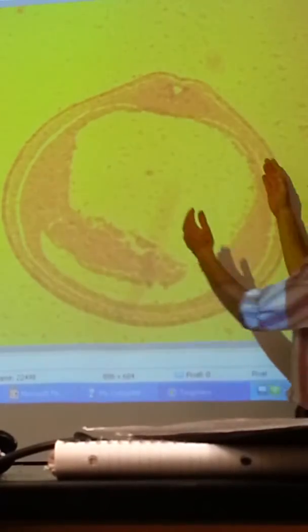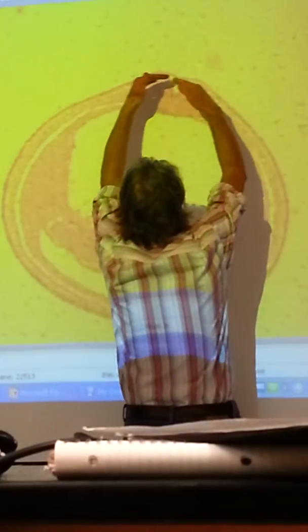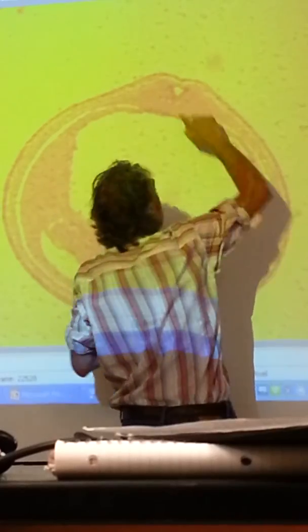I have a really crummy neural tube slide. I've got it on the best section I have, but it's not as good as yours probably. This is showing that the neural groove has come up, fused to itself. There's the little hollow that runs completely down through my spinal cord. Through your spinal cord is a hollow channel full of cerebrospinal fluid.